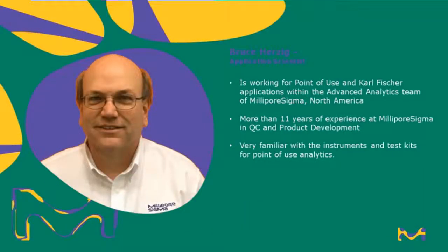The ultrasensitive silicate measurement is very important because silicate becomes a deposit on internal surfaces of turbines. It is a topic for power plants and other process water cycles where we need ultra-pure water in a process. We cannot measure zero, but we can measure very low values with the method that my colleague Bruce Herzig will present to you today. So I will now hand over to Bruce Herzig.